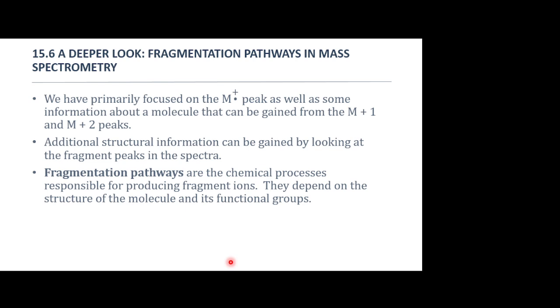Yeah, next to the aromatic, right? And so this tells you a tremendous amount of information about what fragments off. If you get a fragment that's the same as an ethyl, then that tells you that ethyl fragmented off, and that was a fairly stable orientation if the intensity is high, right?